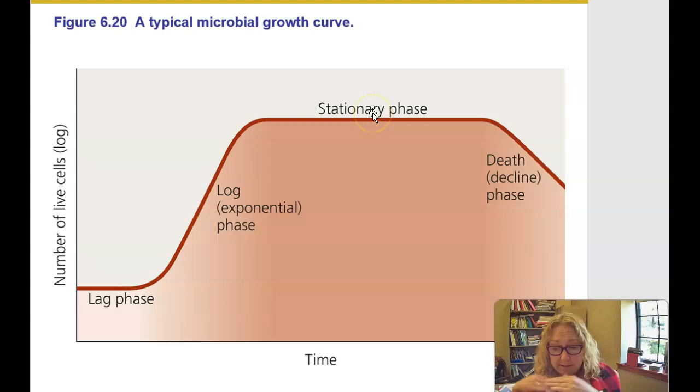It just kind of stagnates and stays, and then it starts to die. So we like to take your bacteria out of the incubators at about, if you do it on Tuesday, we take it out on Thursday. If you do it on Thursday, going all the way to the next Tuesday, you're going to start to see some decline, and it's going to be a big old mess.